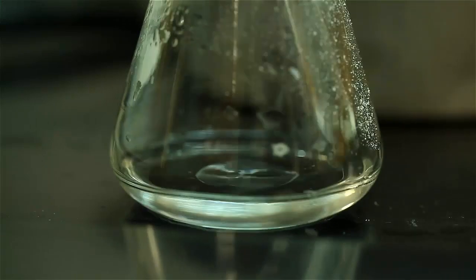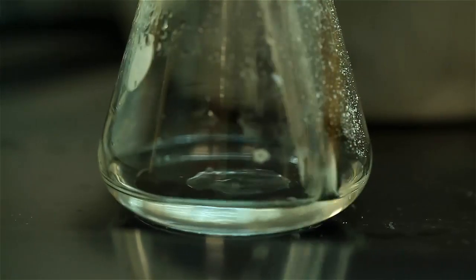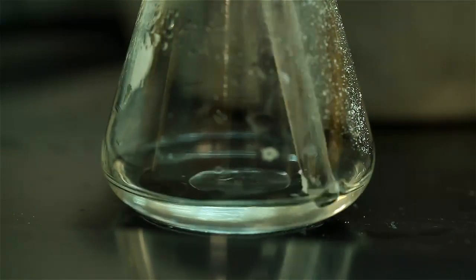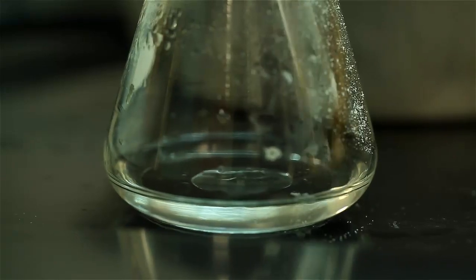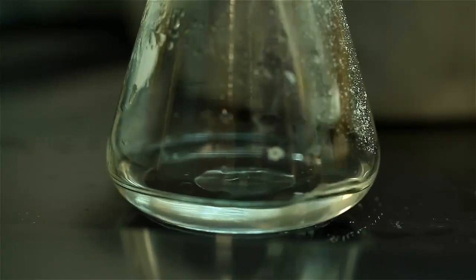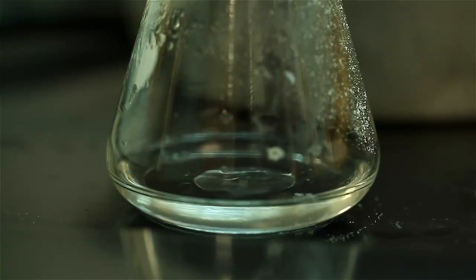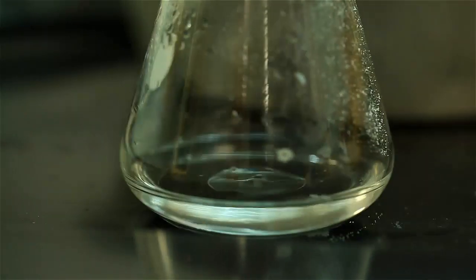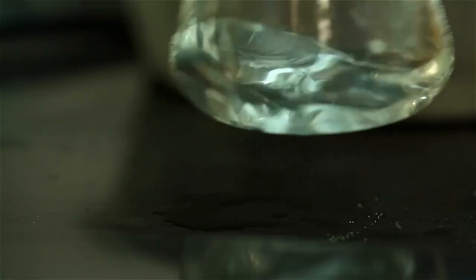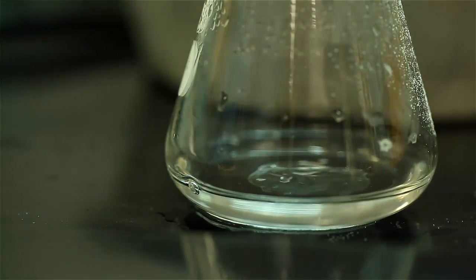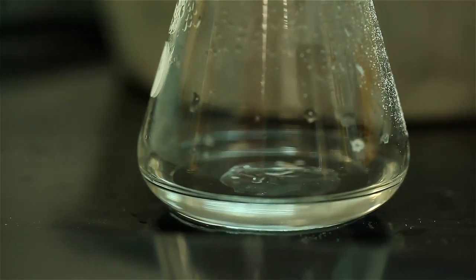If crystals don't form after several minutes of the solution being cooled, there are two common methods to induce crystallization. The first method is to use a glass rod to gently scratch the inside of the glassware. You want to apply enough pressure so that you're flaking off pieces of glass into the solution, which increases the surface area and provides a foundation for the crystals to grow.